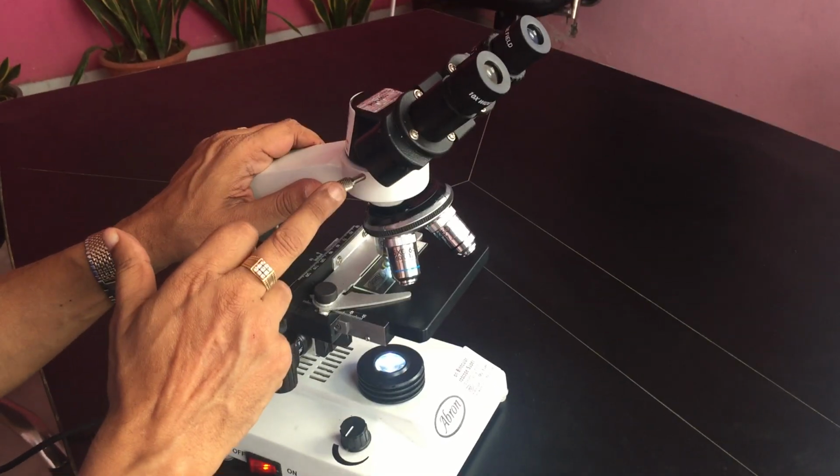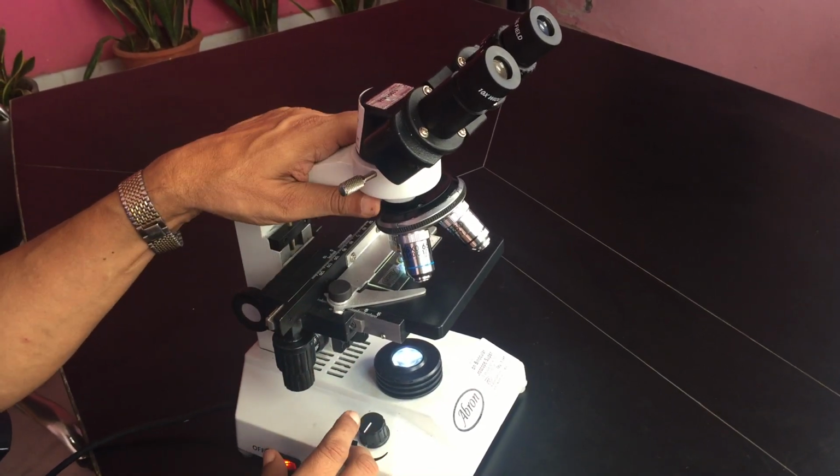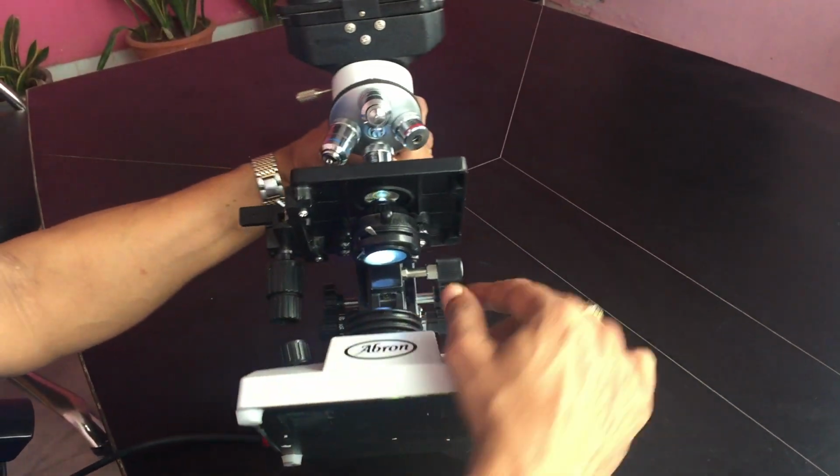This is a binocular microscope. Let us today learn how to use it optimally, the best use. There is an iris diaphragm here.